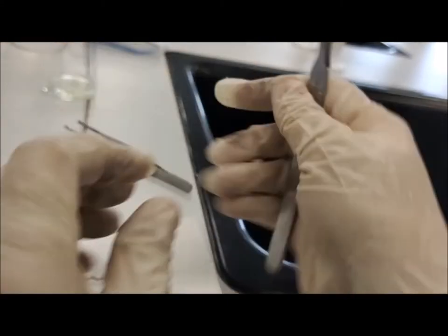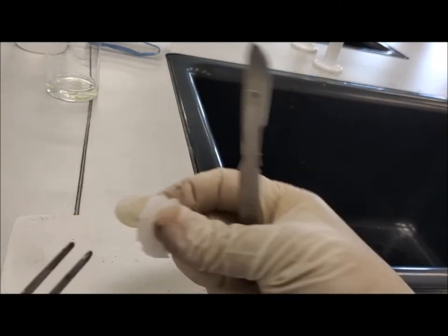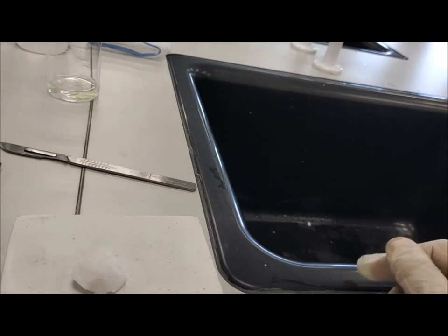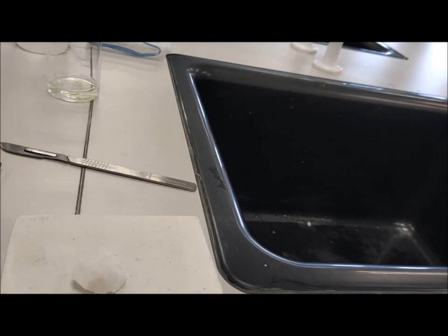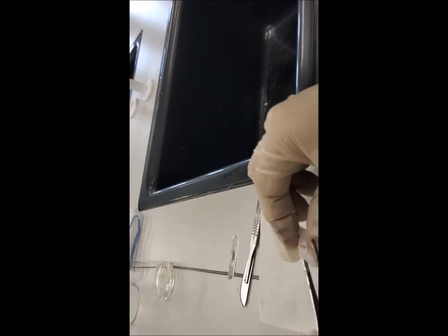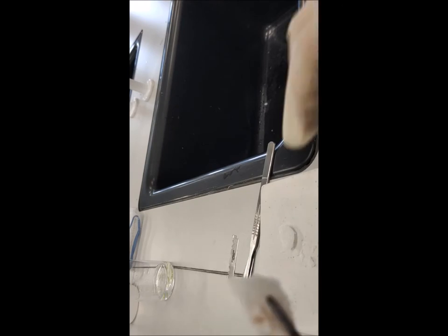The animal tissue — the muscle tissue — is now ready in the paraffin block; it is quite hard now and you can cut it into slices of the different thicknesses that you want. As you can see, the sample is here.